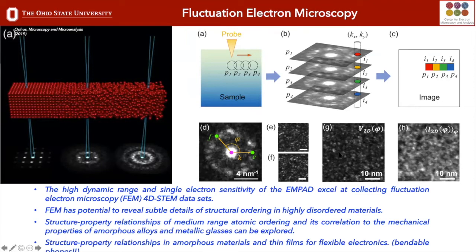And so here, this is an image where you're selecting a certain diffracting vector and you're showing where the bright spots are, that you have a certain amount of short range order with a given vector associated with it. And for things like flexible phones or bendable phones and amorphous films, this type of experimental work will help researchers understand what they're producing.